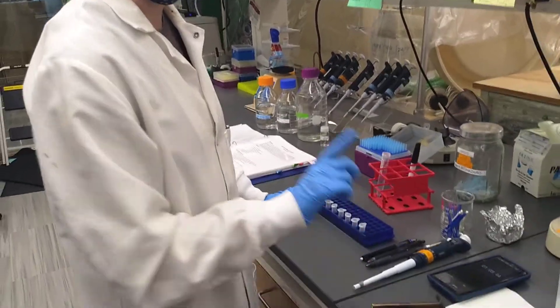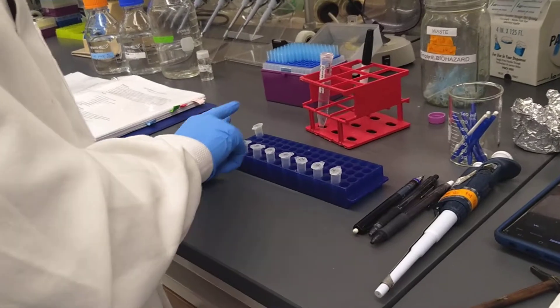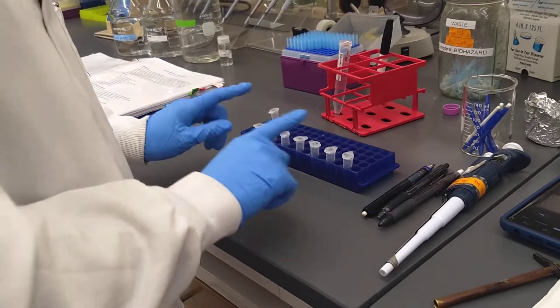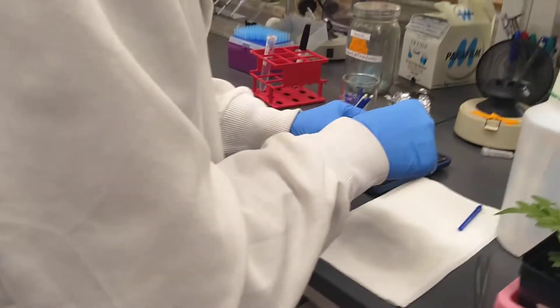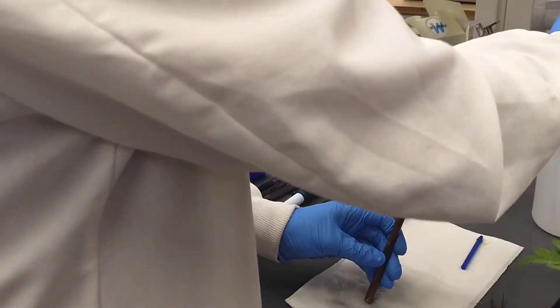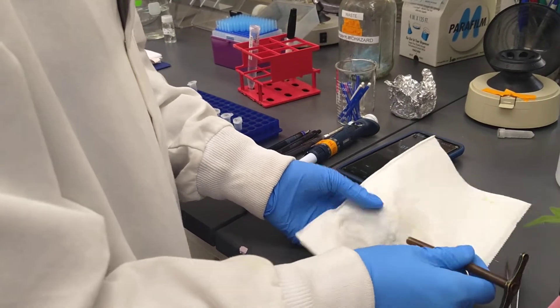Moving on to the next sample — note that what I did not do is take a punch of each one and then grind and then add buffer all at once. You want to go through each leaf step individually, because if you grind a leaf and then give it time to cool down while you're grinding another leaf, what can happen is the DNA can start to degrade.